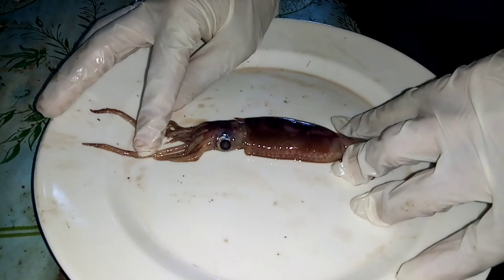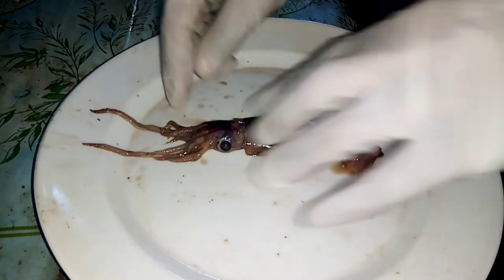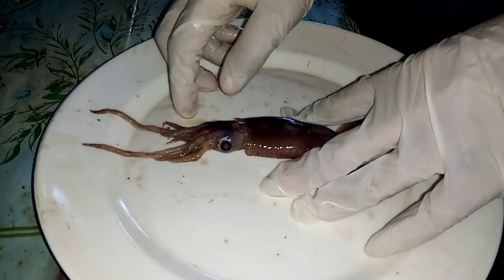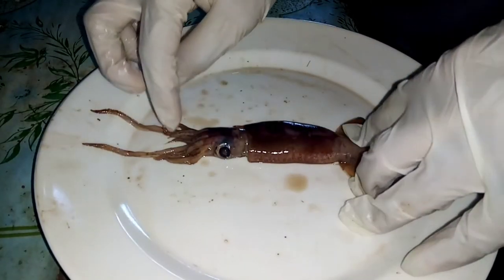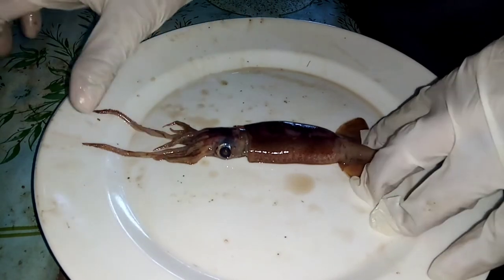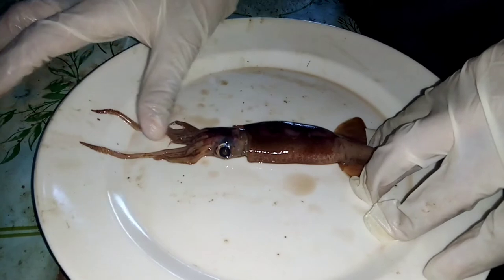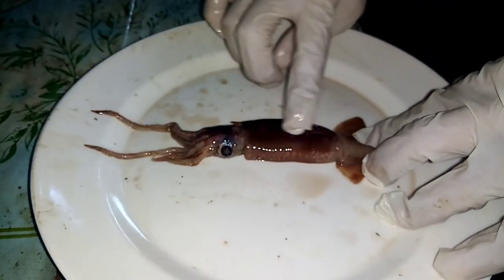Another fact, if we compare it to the octopus, you may already know that the octopus has 8 arms, while the squid, though it has 8 arms, has an additional 2 tentacles. And next part, we have this mantle.